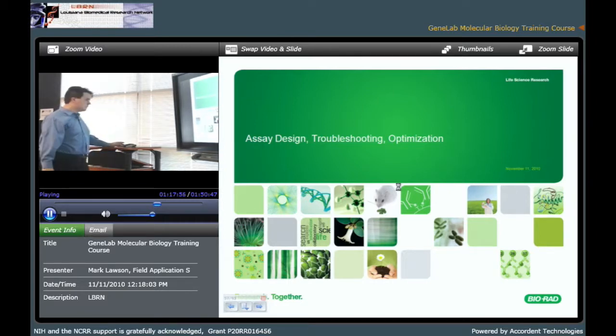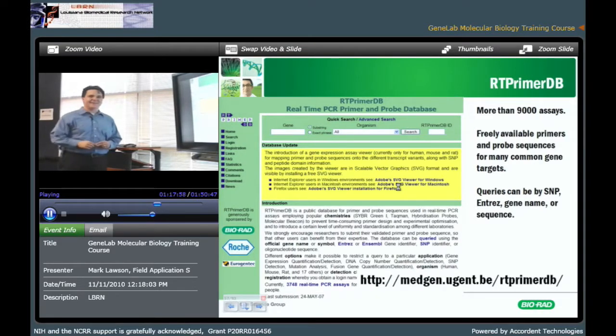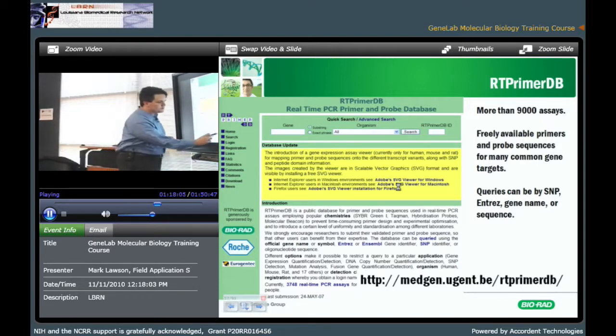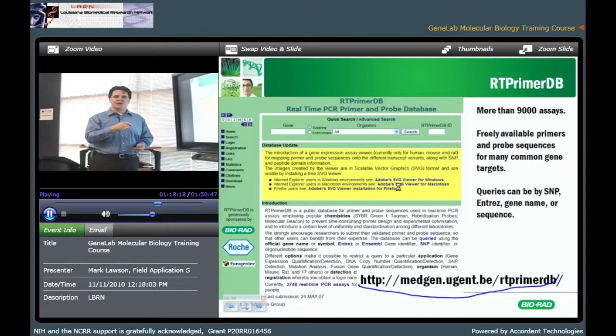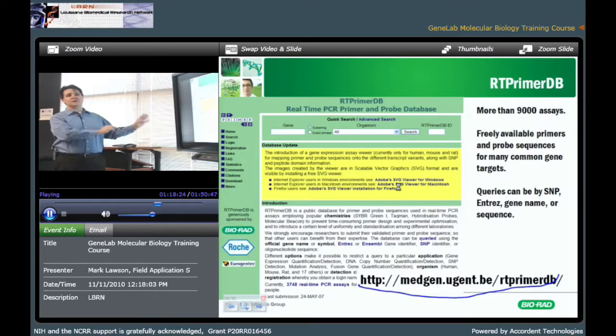Okay. So another 20. So the shortcut, and I love this, and this is also the work of Vandesompele. The shortcut here is to go to his database, which contains user-submitted assays. And that means that if someone's published a real-time assay for a particular gene, they can upload it to this site, fill out a small form that goes through how the assay was designed, how it performed, maybe a figure or a graph, and all of that information is uploaded to the database for other people to search and use. This is part of the scientific community filling a need that everyone has, and that is for new assays. So you should never have to design your own housekeeping gene assay.